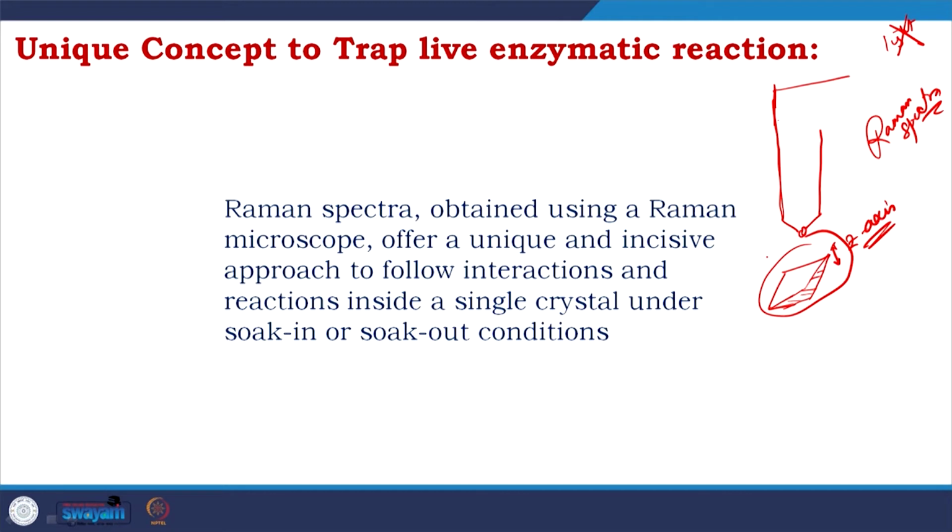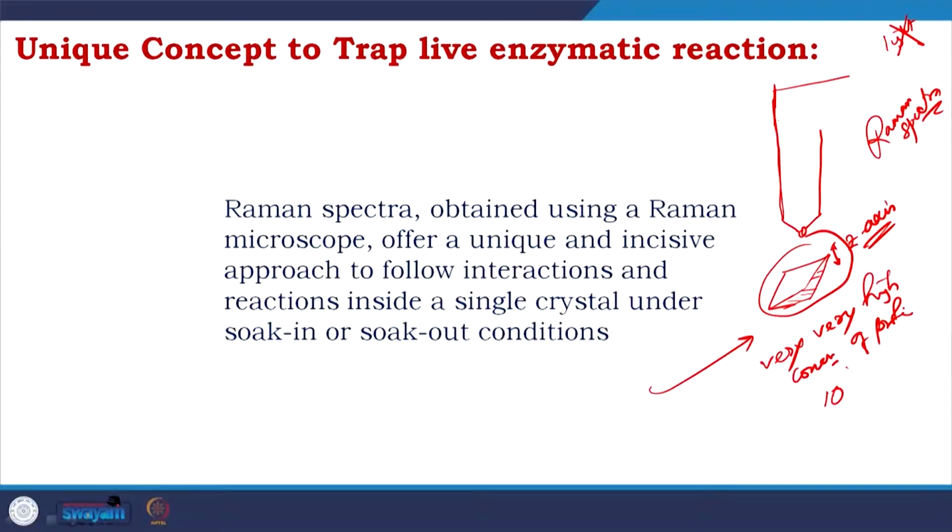What is the advantage? First advantage is very high concentration of protein, right. If you compare a solution of protein with a crystal at the same concentration, at least you get 10 to the power 6 to 10 to the power 10 times enhancement.